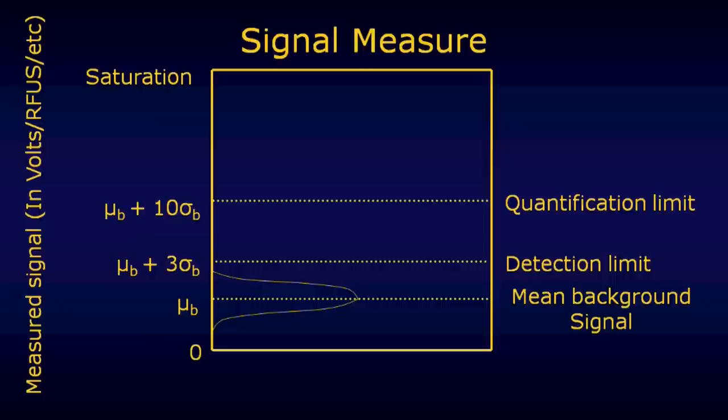the limit of detection. For any kind of instrument that's recording voltages or light impulses, there's going to be a fluctuation of the baseline, just a random noise, a static sort of effect. Sometimes the static will be for an instant louder than at another time, right? We can measure the heights of those random bits of noise and get an average value and a standard deviation associated with that average value for the background noise, the stuff that's just going on along at the baseline. And a limit of detection then is simply this. It's the average level of noise plus 3 standard deviations.